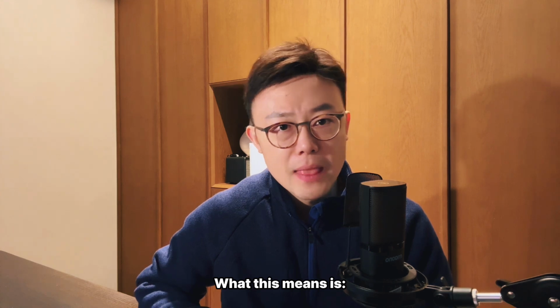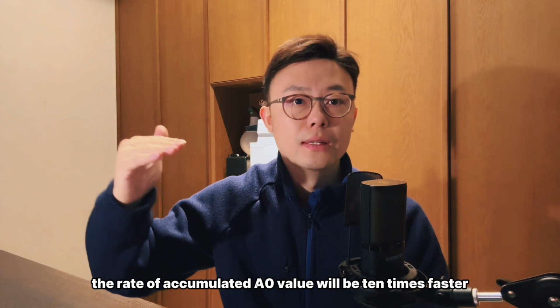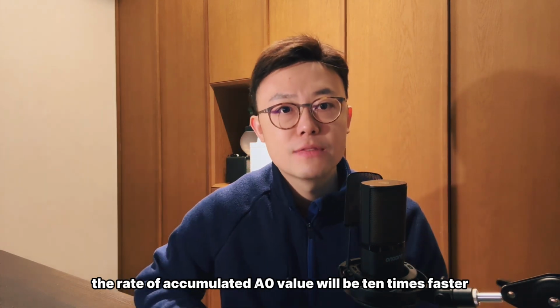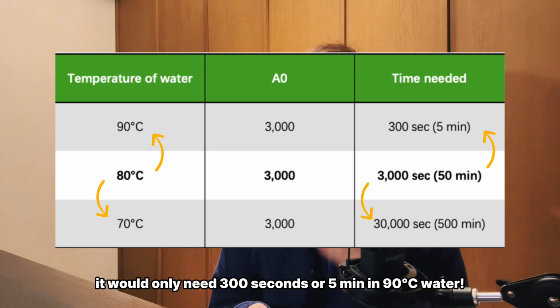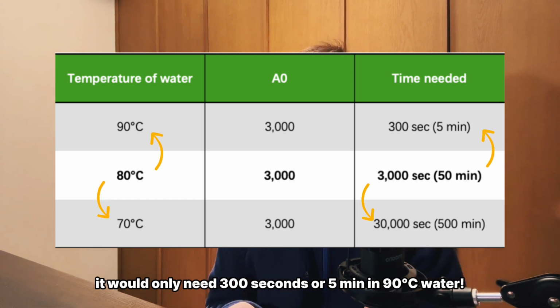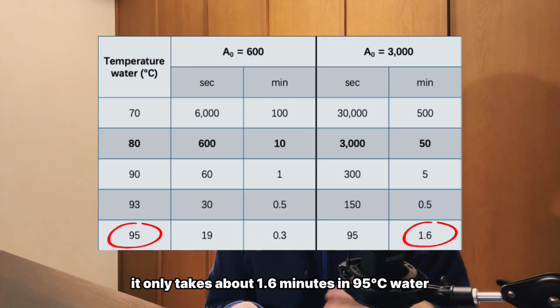What this means is, for every 10 degree increase in temperature, the rate of accumulated A0 value will be 10 times faster, and vice versa. That means to achieve an A0 value of 3000, we would only need 300 seconds or 5 minutes in 90 degree water. And if it goes even higher, it takes only about 1.6 minutes in 95 degree water.